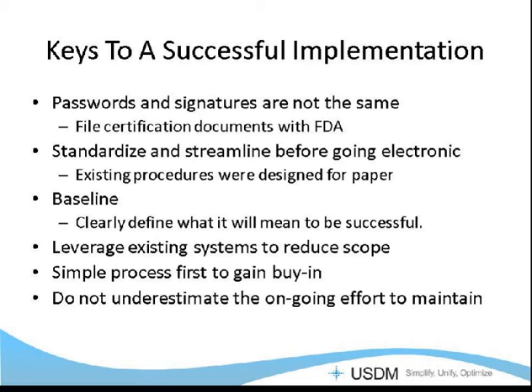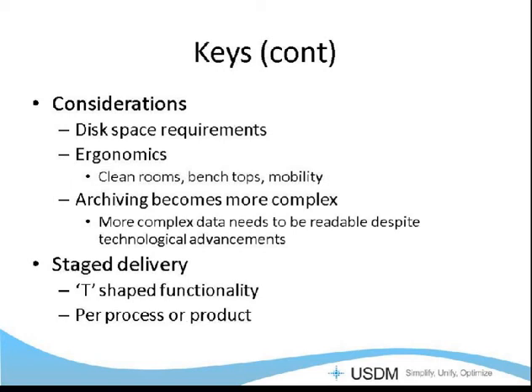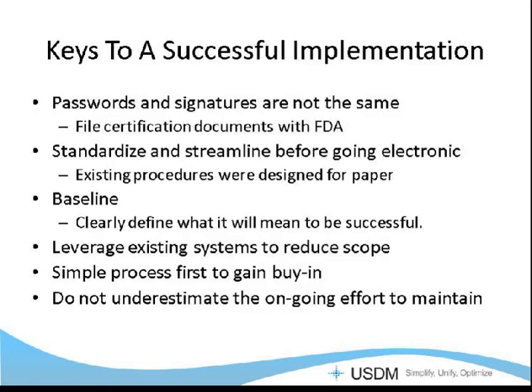You're talking about capturing all of the activity that an analyst performs. There's going to be a lot of changes and a lot of effort, and you have to take into account that you're not just going to have savings from the lack of work that you needed to do, but you're going to have a lot of extra maintenance effort required.